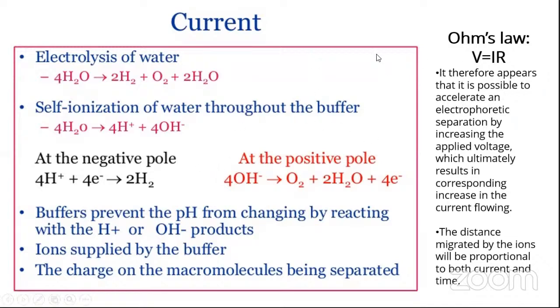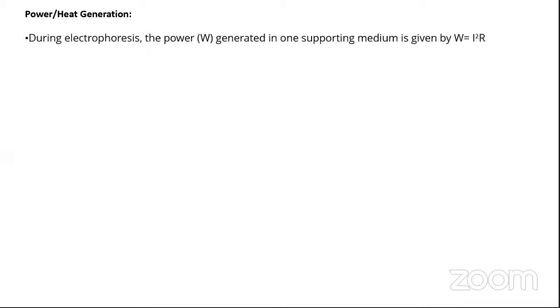So there has to be some way by which you can actually control resistance. Resistance is majorly because of the frictional coefficient associated with any charged entity moving under the effect of an electric field. This frictional component leads to another factor, which is associated with heat generation or power generation, because now there is another concept coming into play.